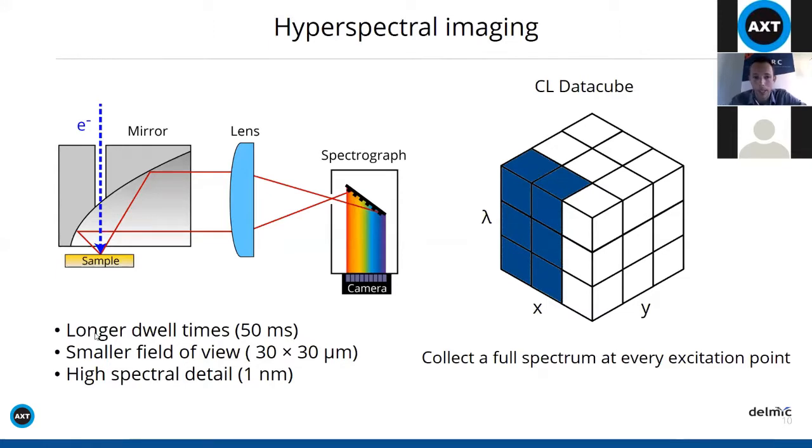And then you also have a little bit smaller field of view, which is related to the optics that is required to do such a measurement. This is typically more suitable to really study a region of interest, unless you have a way to do stage scanning, which is something that we can also do for some SEMs.